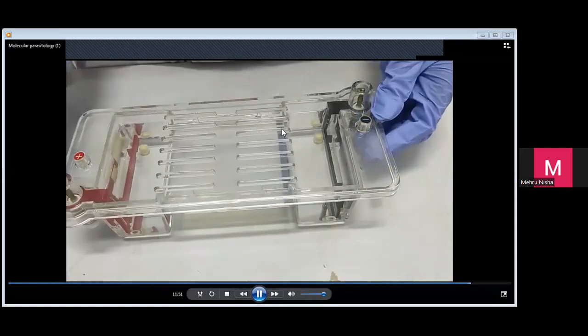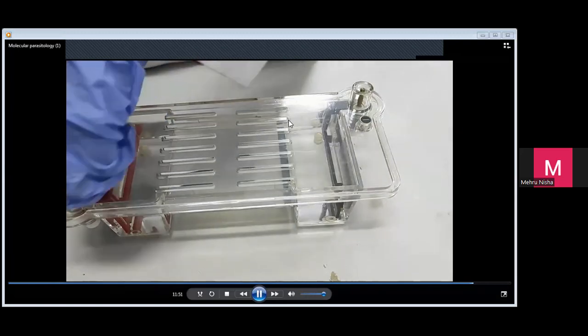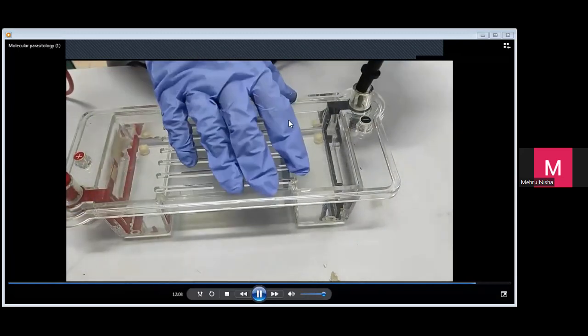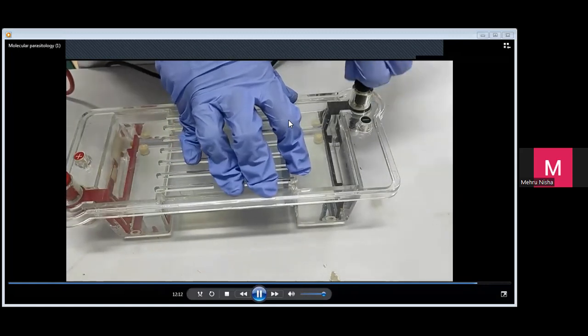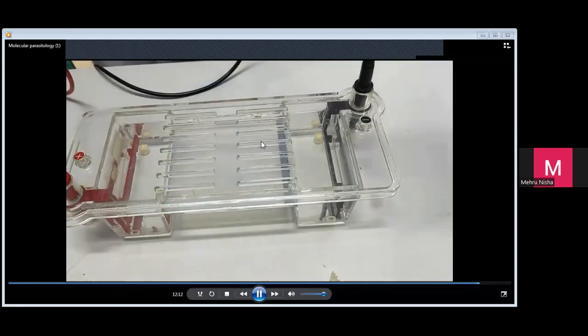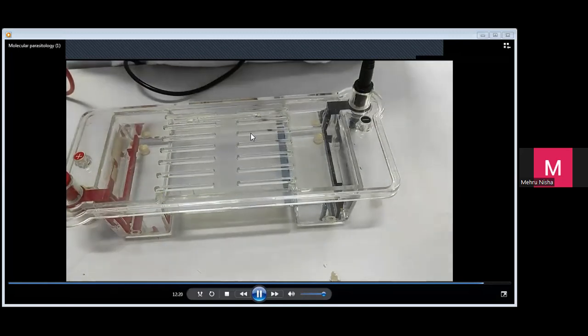And we will be covering it and run the gel at 90 volts, maybe 30 to 40 minutes, depending on the size of your product. This one you can monitor because the blue dye will be moving. So if you feel the blue dye has reached here, then I think you just stop it, then you view the gel.